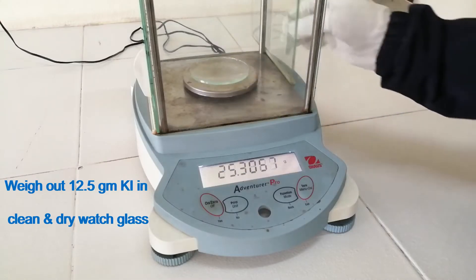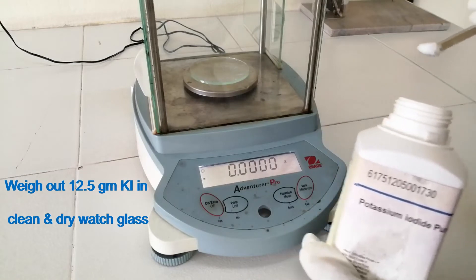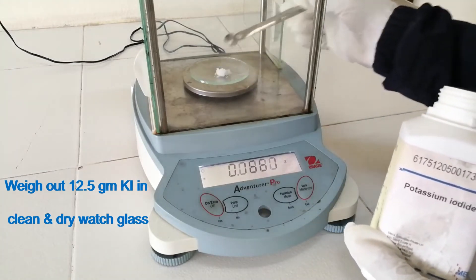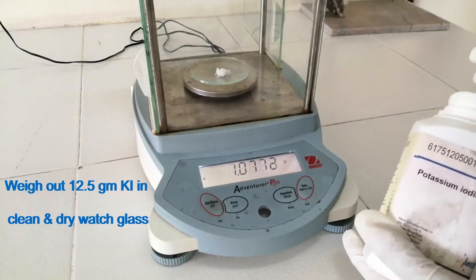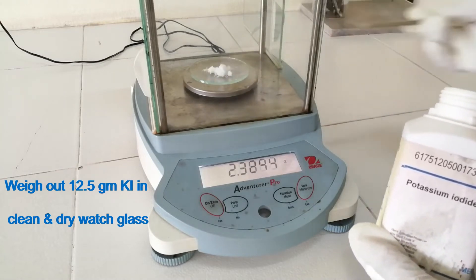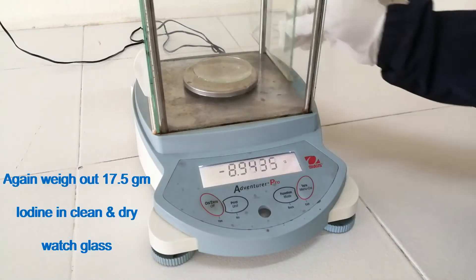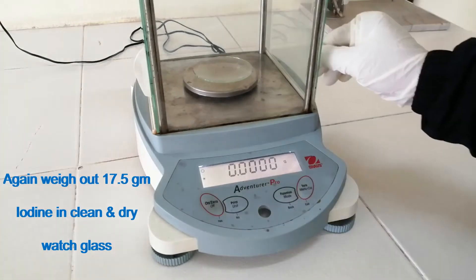Weigh out 12.5 grams of potassium iodide in a clean and dry watch glass. Then weigh out 17.5 grams of iodine in a clean and dry watch glass.